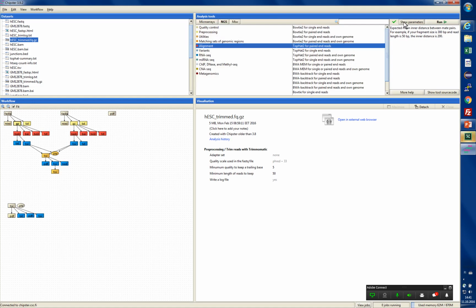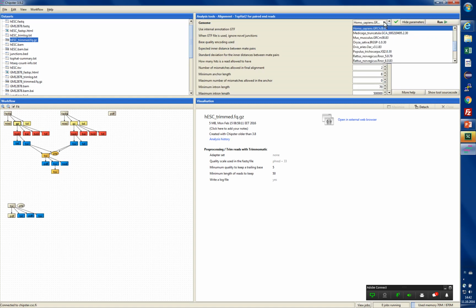There was a question regarding the reference genomes. Ridul is asking if one can also align against an older version of the human genome. That would be here. They have slightly different names.